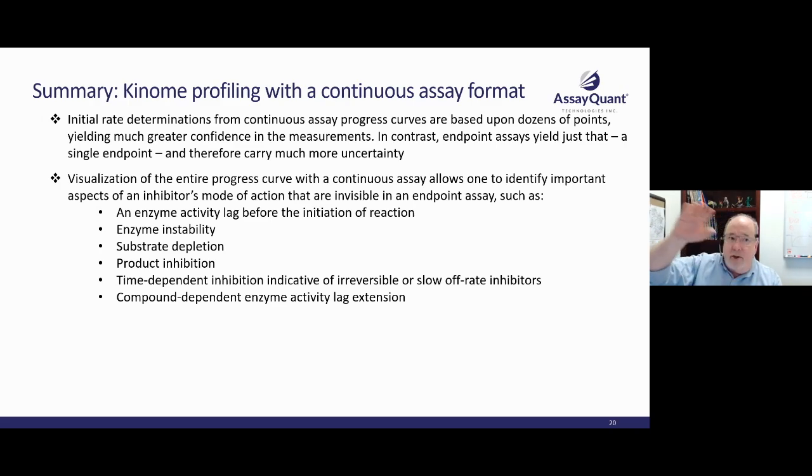If it's actually saturating, that could be enzyme instability. It could be depletion of the substrate. It could be product inhibition, but it could be that really interesting time-dependent inhibition, which you can use to diagnose and fully characterize irreversible and slow off-rate inhibitors.